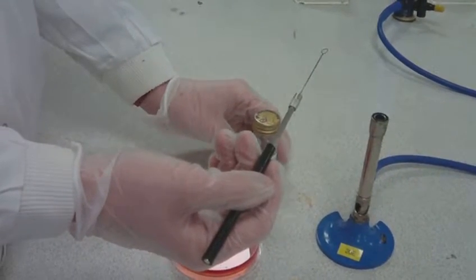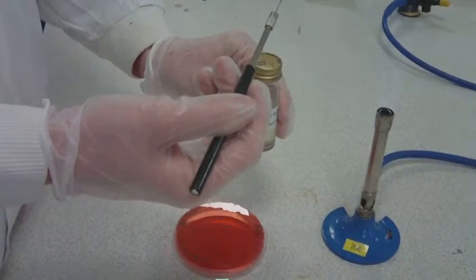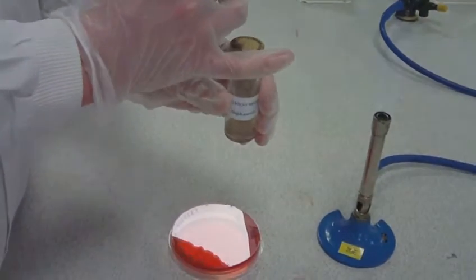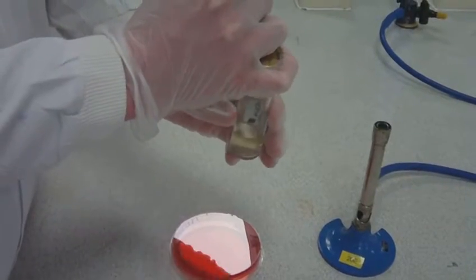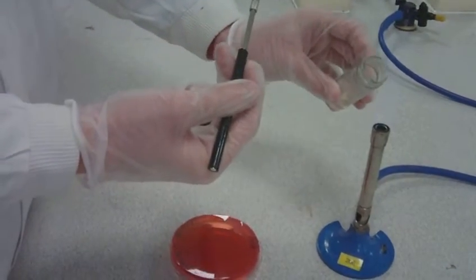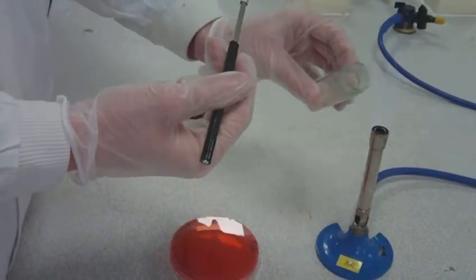Without putting the loop down, lift the test tube containing the inoculum with your left hand. Remove the cap of the bottle with the little finger on your right hand. Pass the neck of the bottle through the flame 2-3 times so it becomes sterile.